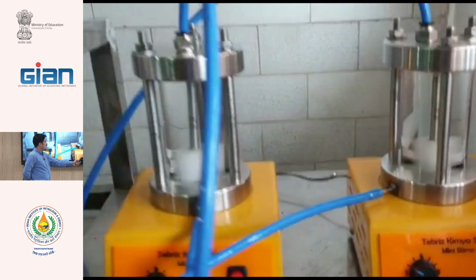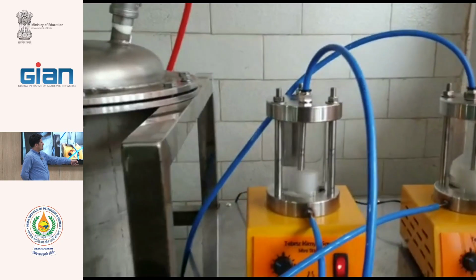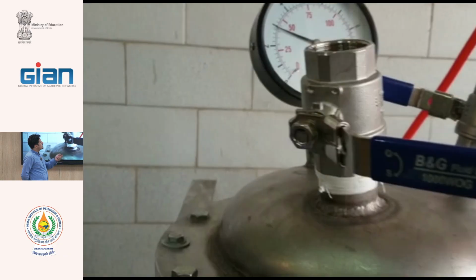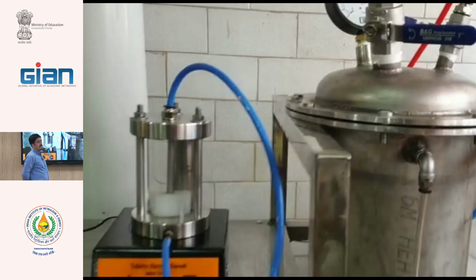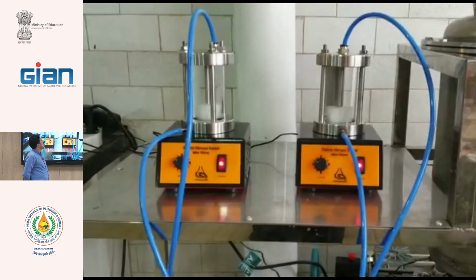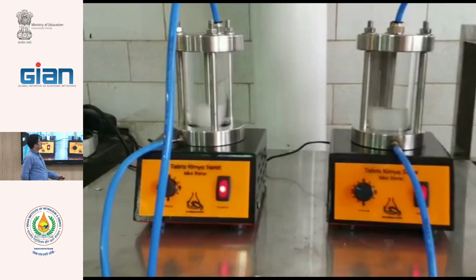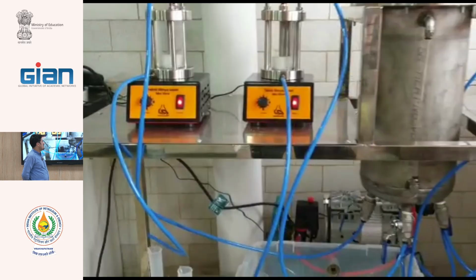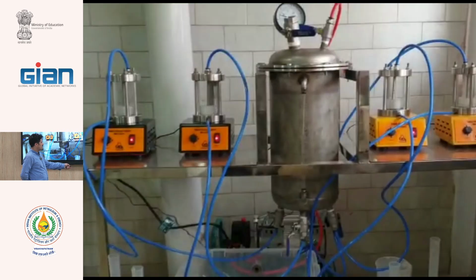And the permeate comes from this blue one, the applied pressure is 3 atmospheres. And we measure the volume with this cylinder.